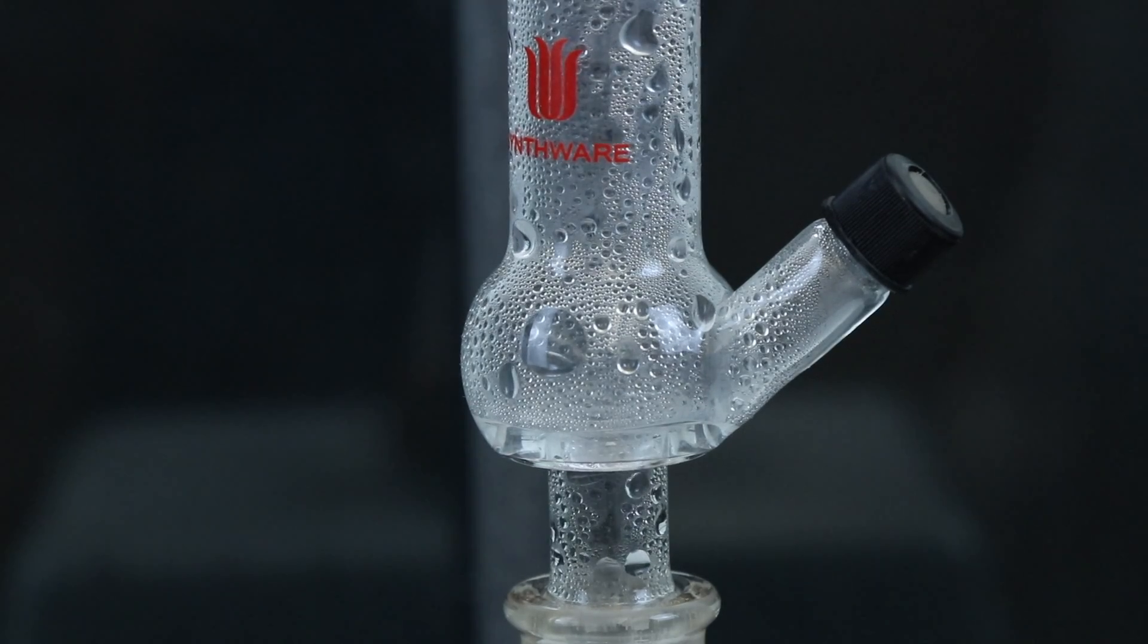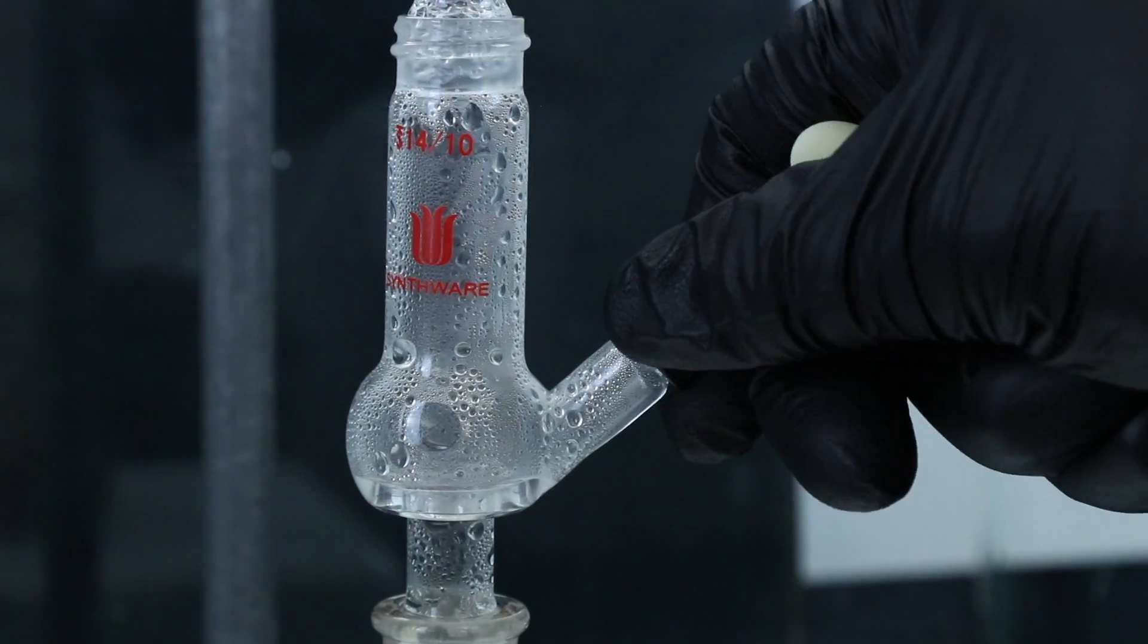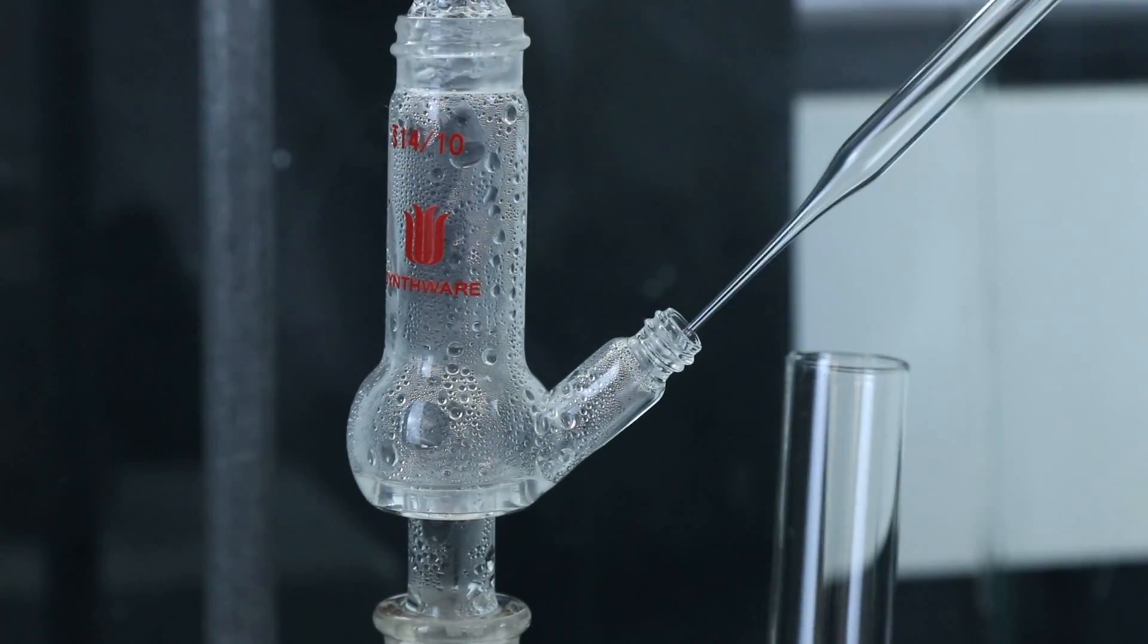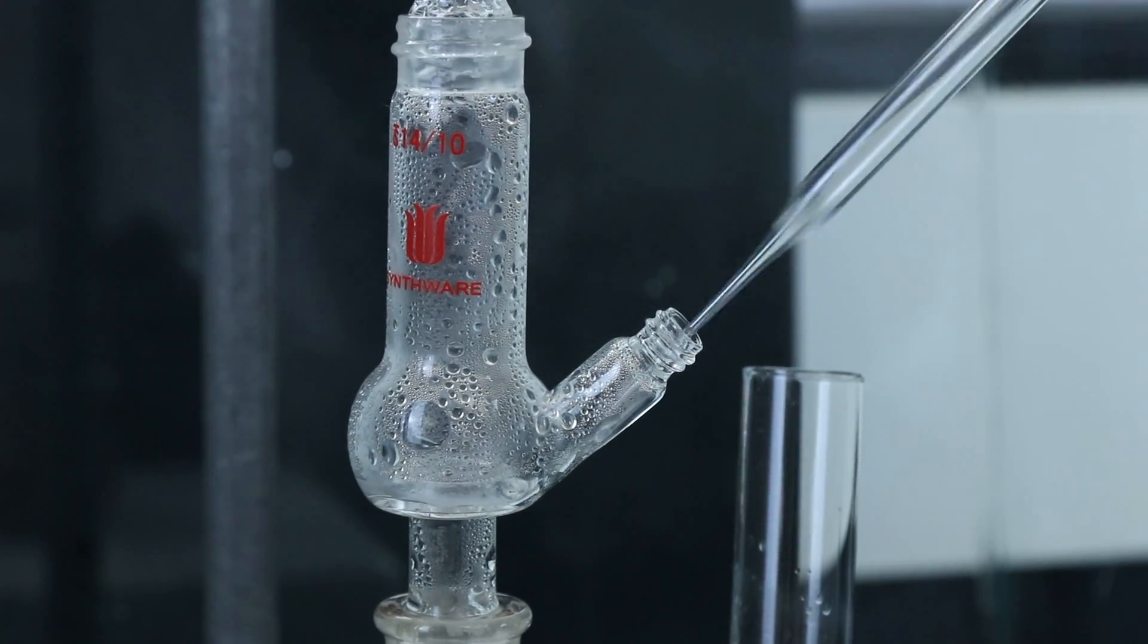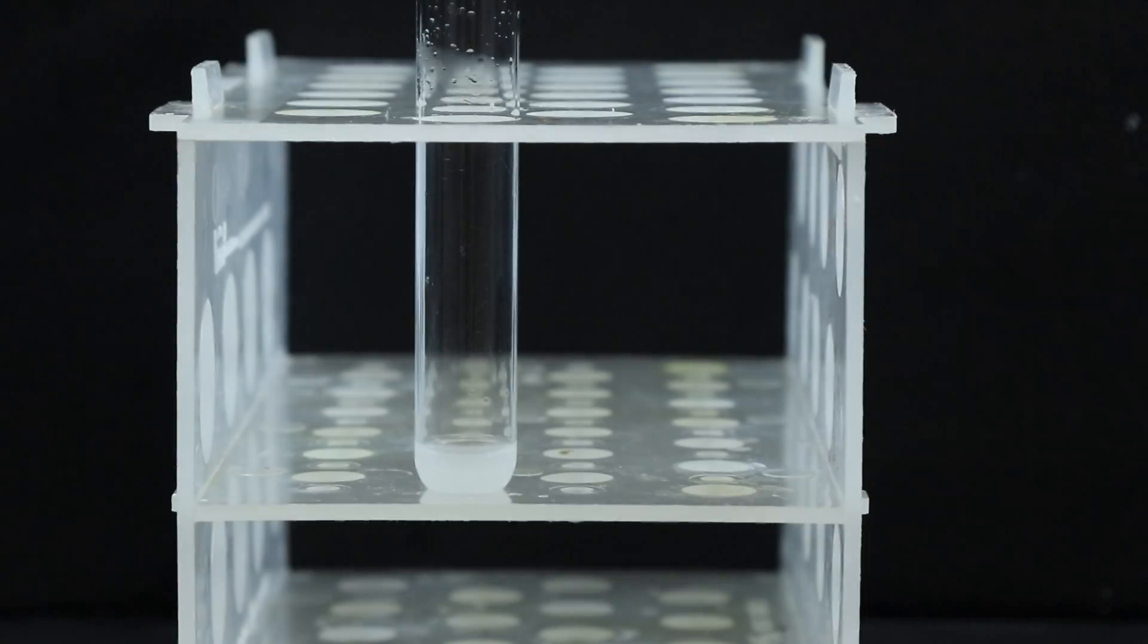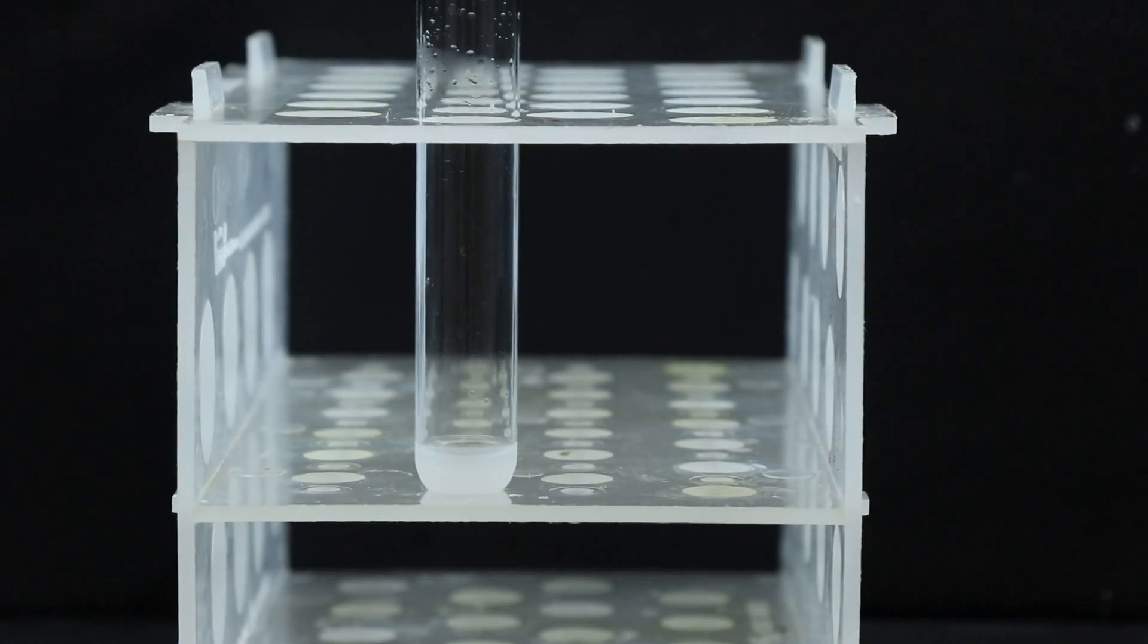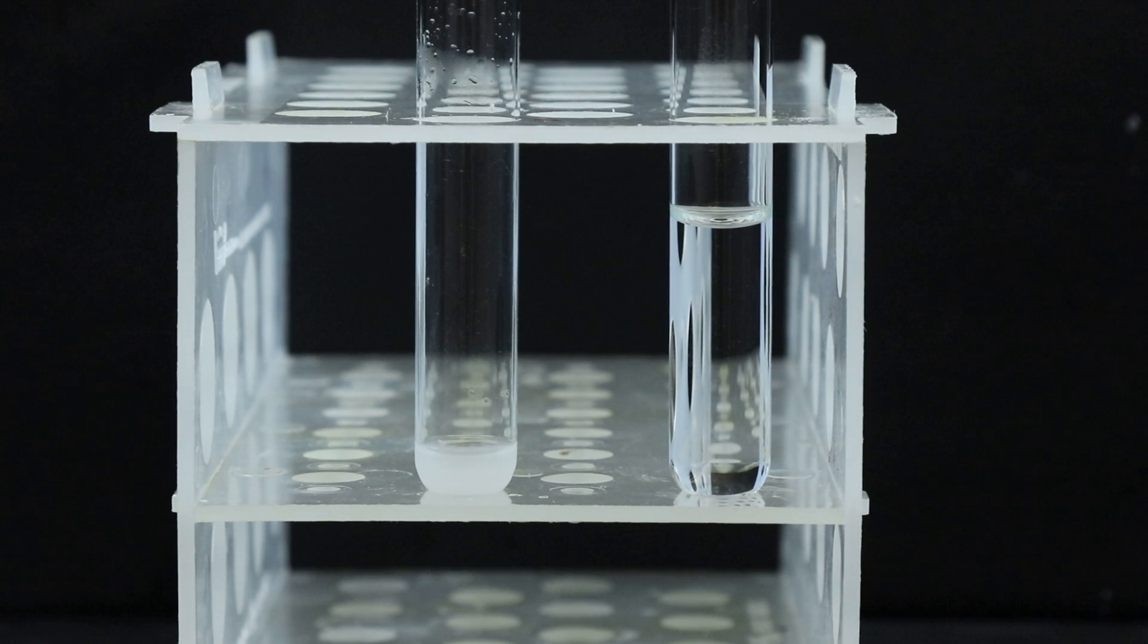It looks like enough distillate has gathered in the Hickman still now so I'm going to go ahead and start removing it and transfer it over to a test tube. I'm going to keep doing this until I've gathered five to seven milliliters of the distillate and I have a separate test tube filled with about seven milliliters of water as a reference so I'll keep going until it matches that.